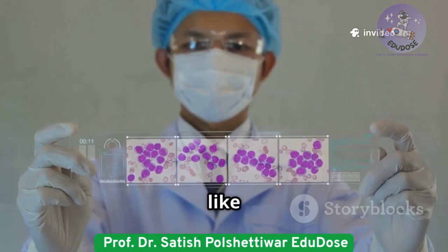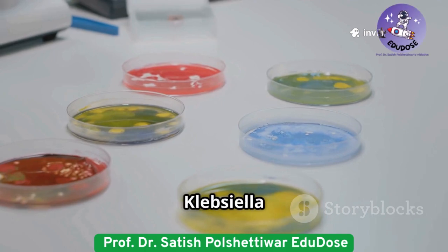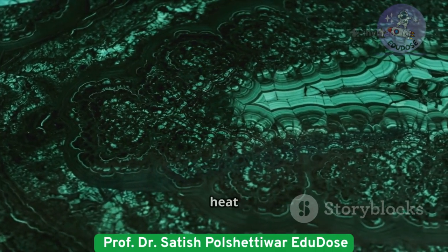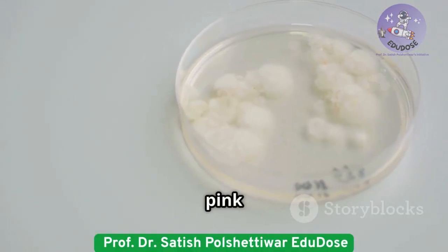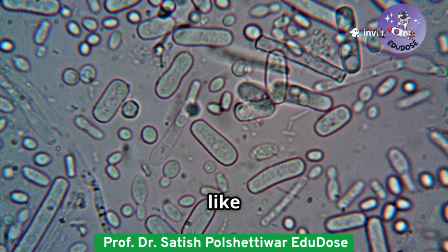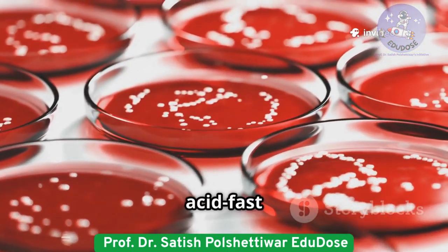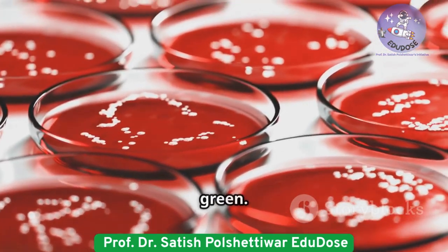There are also some special staining techniques worth knowing. Capsule stains, like India ink, show a clear halo around bacteria such as Klebsiella pneumoniae. Endospore stains use malachite green and heat to highlight tough spores, with vegetative cells showing up pink. Think Bacillus species. And acid-fast stains like Ziehl-Neelsen pick out Mycobacterium tuberculosis. Acid-fast cells turn red, while non-acid-fast ones go blue or green.